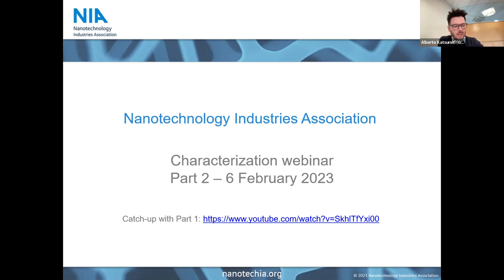So, for example, I think this is something that we do. I didn't show these results here because this was very focused on ecotox, but definitely we can do it. For example, in the case of nanocarriers, this is really relevant because it's one of the mechanisms explored for the efficiency of these nanodrugs. In the case shown here, in these images and also in the 3D image analysis, we can see that these nanodrugs were developed mainly to end up in the lysosomes of the cells. As we know, lysosomes are very acidic organelles with a pH of around 5.5. So it is very relevant to understand what happens in this acidic environment as well.